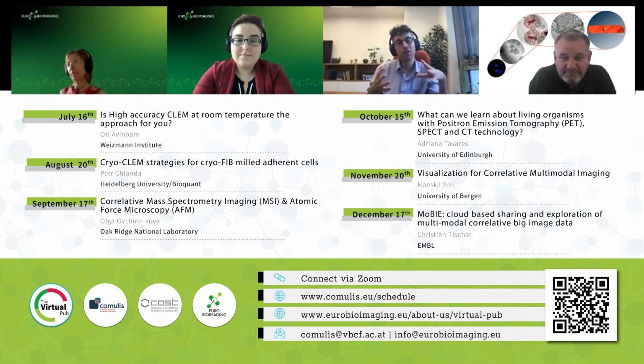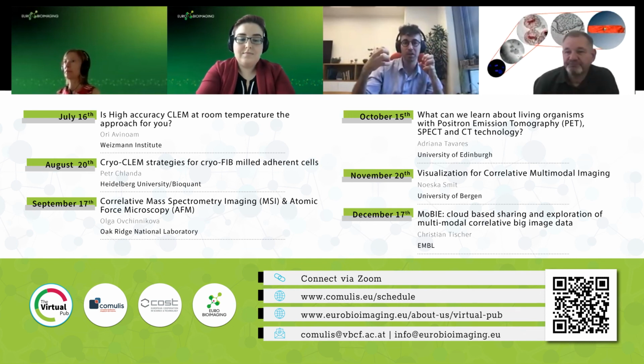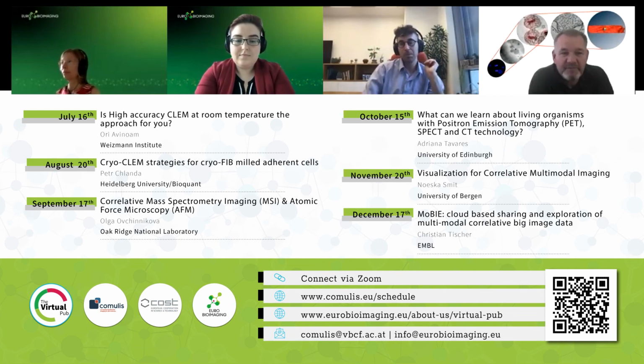And then once you've locked into your cell of interest, you can even, with enough precision, acquire the object, because you still have a reasonable field of view. And then if you want to know within that field of view where exactly your vesicle is in a sea of vesicles, then you have to rely on high accuracy. And then you run into scenarios where you may even have to improve your fluorescence microscopy paradigm to resolve things better, even in the EM. I hope I answered. How long?